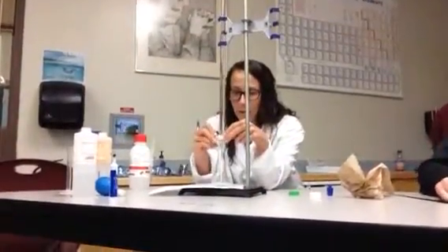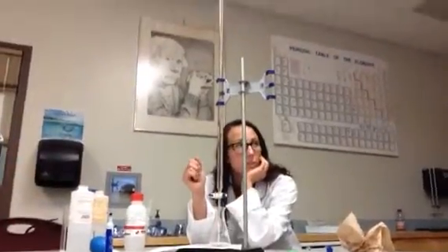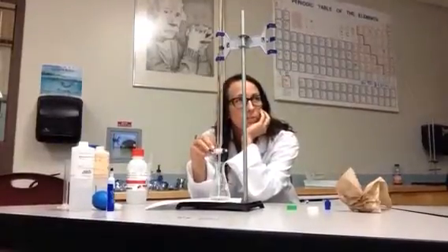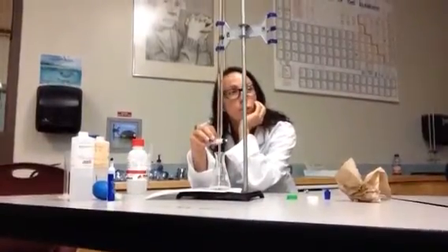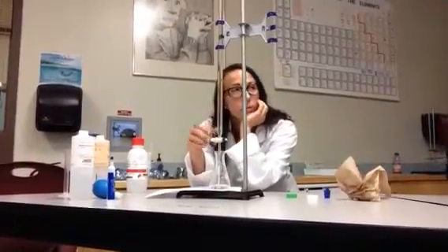All right, so I'm going to open this up. Okay, why is it pink in that little spot right there, but then it disappears? What's the matter, Sabrina? Okay, then answer the question. Why is it pink here in this spot? Because it neutralizes.